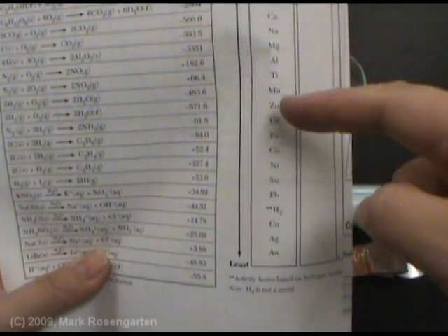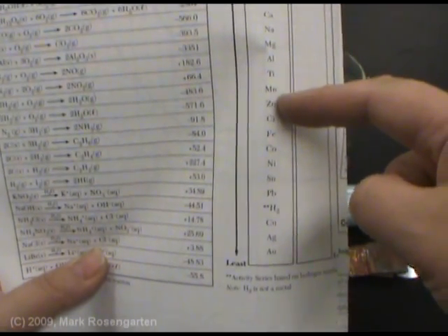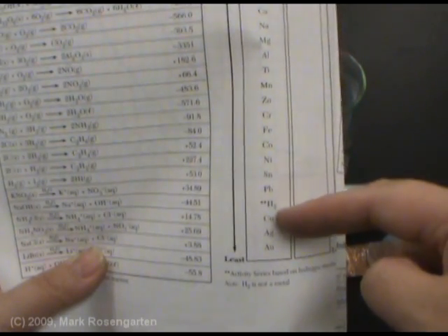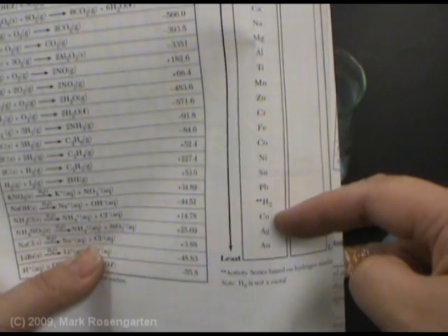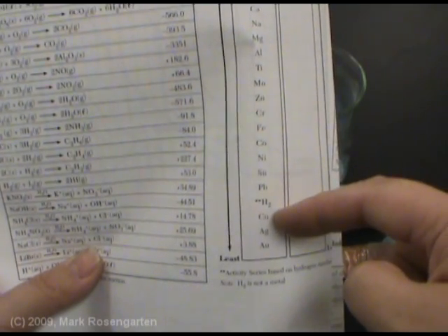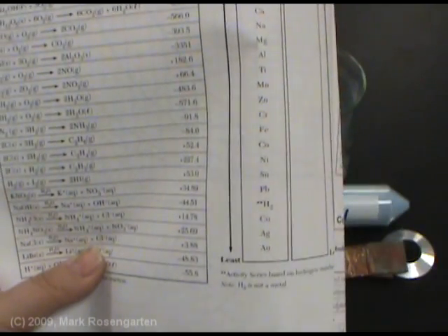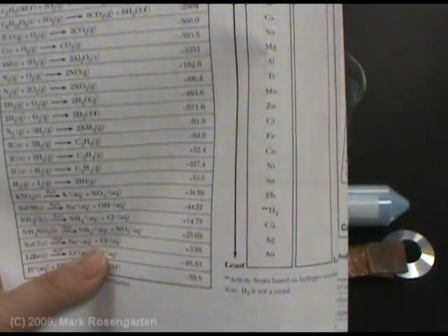According to reference table J, zinc is a much more active metal than copper is. Therefore, zinc should be able to replace copper in a copper compound, but copper should not be able to replace zinc in a zinc compound. Let's put that to the test.